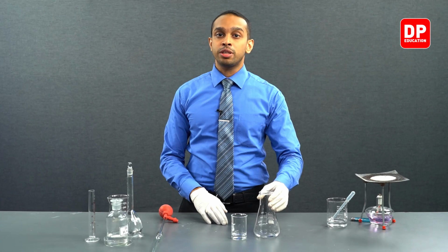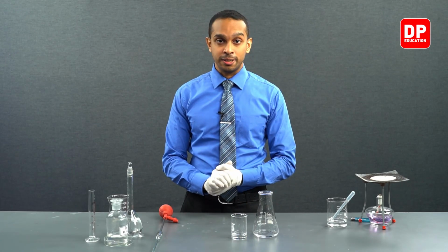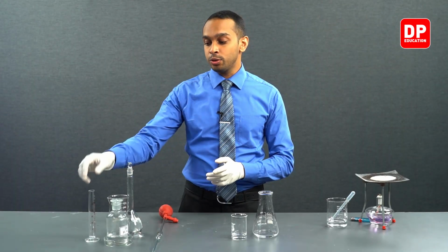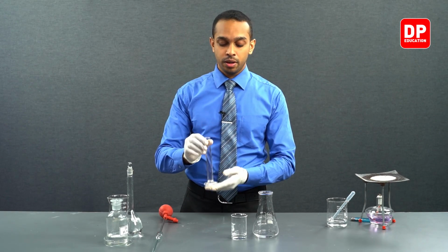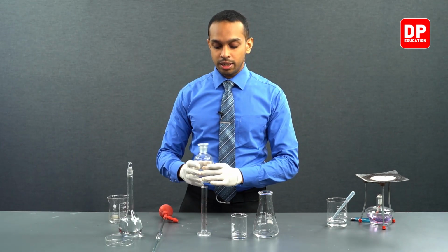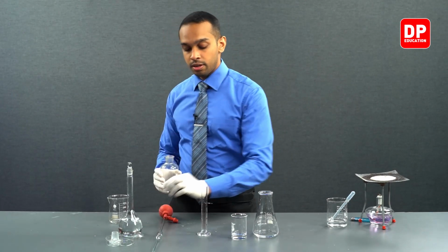Addition of dilute sulfuric acid is done just to make this solution acidic. We do not need to measure the volume of sulfuric acid that precisely. So we can use a measuring cylinder. We will be using a measuring cylinder to measure 15 cubic centimeters of sulfuric acid.